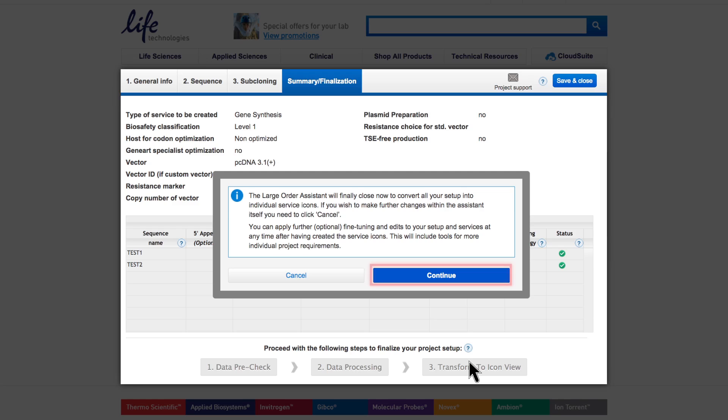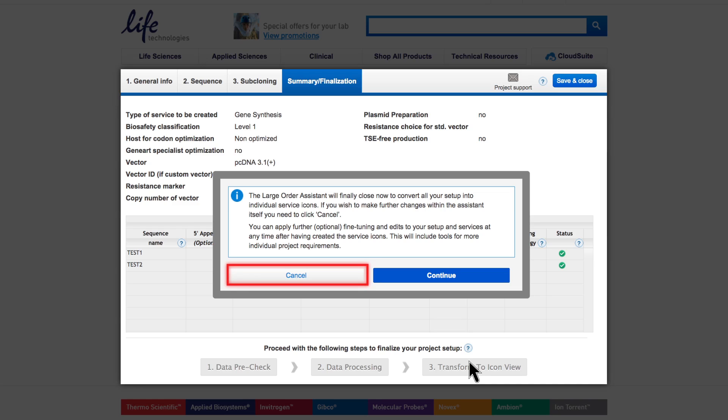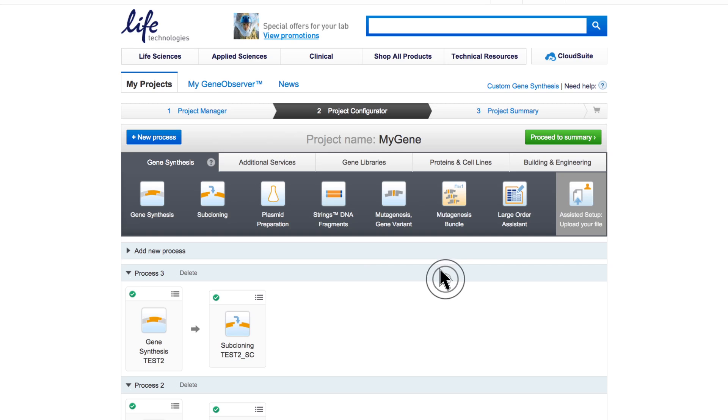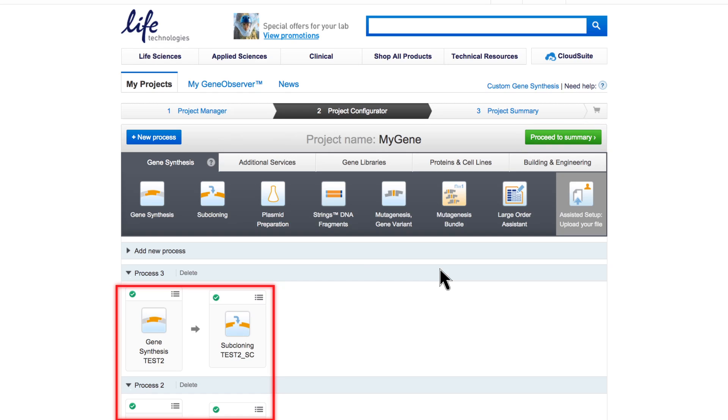Continue to close the Large Order Assistant and generate your icon view of the project. If you still need to perform changes within the Assistant, click Cancel. You can now proceed to summary. You can also, if needed, open individual icons to further edit the details.